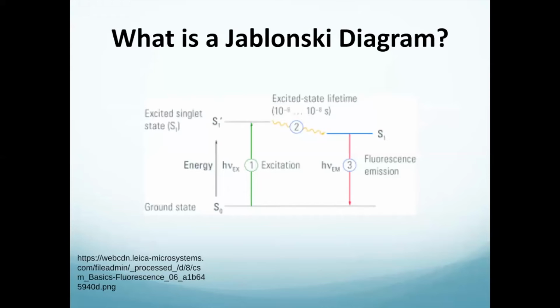Every fluorophore absorbs light of a certain color and emits light of a certain color. And we choose different fluorophore molecules depending upon the image we're trying to see. Now, how does all this work within the actual microscope? Terry is going to talk about that next.